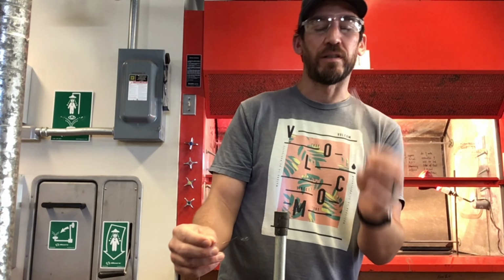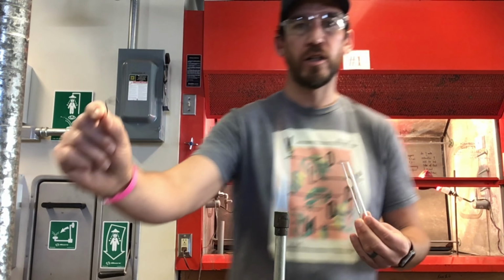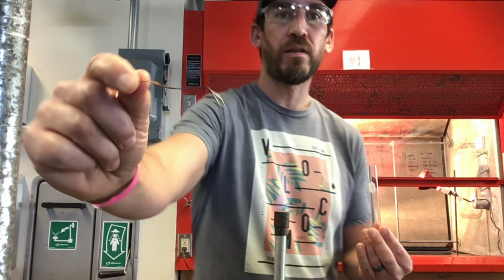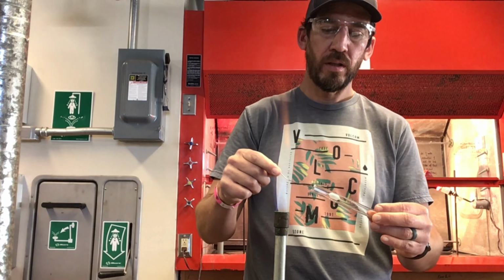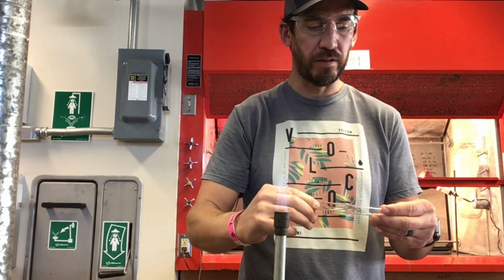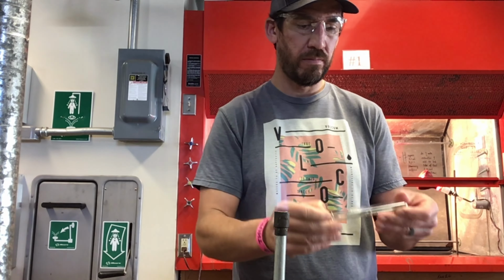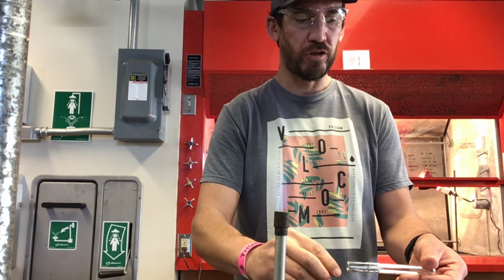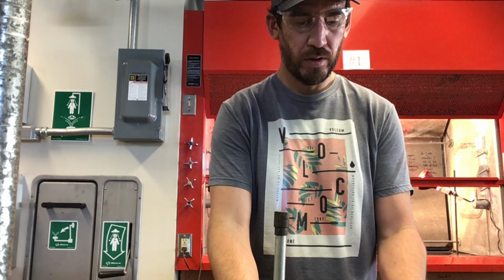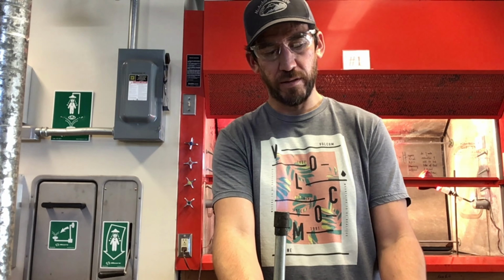Here's a solid material. Trying to test the solid material is a little bit harder when you've got your loopy-loop here, right? We'll do our best though. What I do is I kind of just get a little solid material thrown right on top of it. And see? So this is what happens. You just struggle for a minute. It's not chemistry lab. It's definitely not alchemy. You're not struggling. Come on now, let's see what this is.